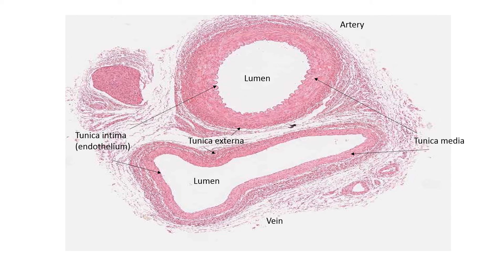Note the difference between the artery and the vein. What do you notice? If you look carefully, in some cross-sections of arteries the endothelium is folded, but not in a vein. So that's another way of telling the difference between an artery and a vein — it has a folded endothelium.